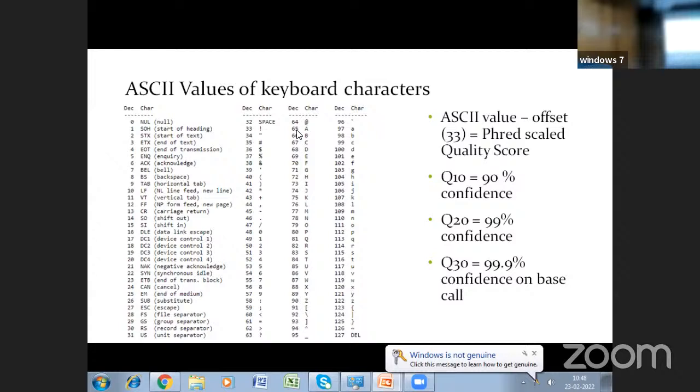It is actually a sequencer offset value, because the sequencer assigns the quality value. There are two kinds of offset values that sequencers assign. Different sequencers, like the Solexa platform, have an offset value of 64. Phred code is manual; they could have directly used the number, but they found that ASCII symbols are more relevant to derive from that number. So in the header, whatever number they have given, they mention it is an offset value of 33 minus. If it is set in the sequencer, you have to follow that.